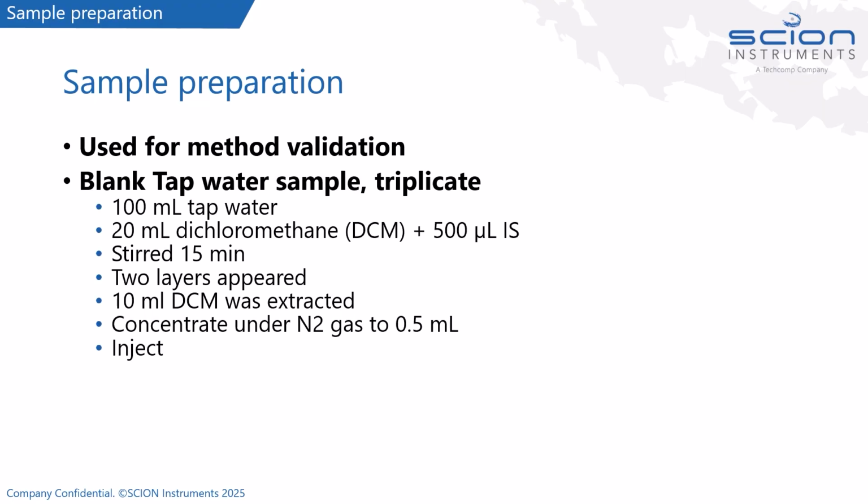Sample preparation. For the validation of the method, spiked samples were made. The samples were spiked at the LOQ level, making sure that the method was working correctly. First, we made triplicate tap water samples.